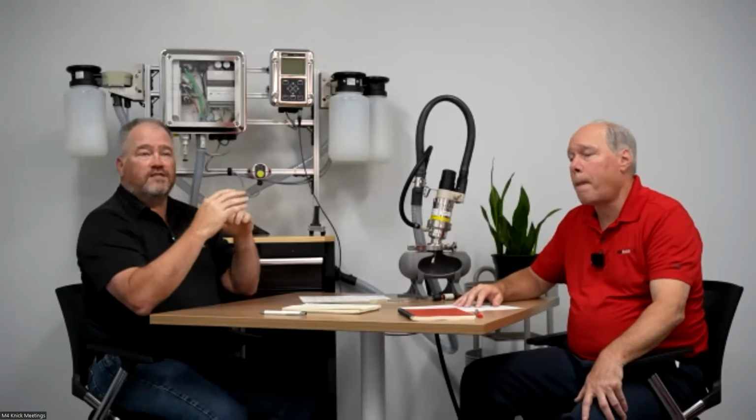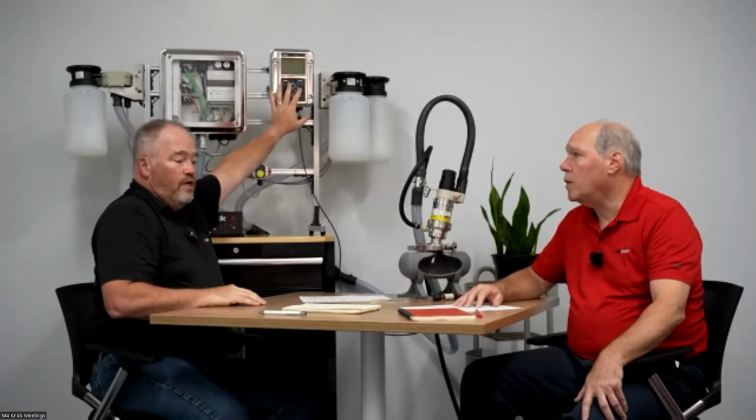So the question was, is it possible not to freeze the output, I believe is what we're talking about, when you do calibration of a pH probe. Hopefully I got that correct. So I'm going to answer it as best as I can. When I do a calibration, whether it's an automated calibration or an automated cleaning, it applies to both, the system recognizes when the program activates. So it knows that it's about to retract the electrode. So before it retracts, it puts the output into hold.